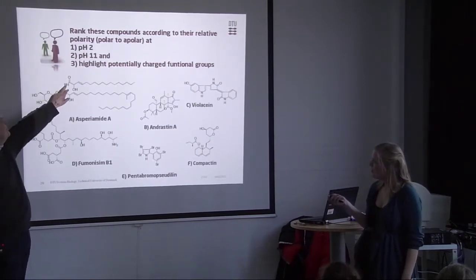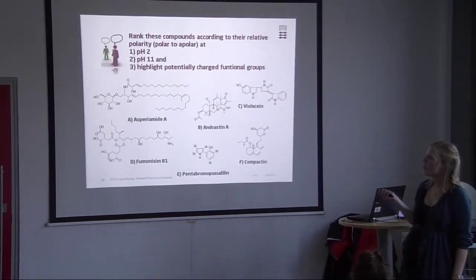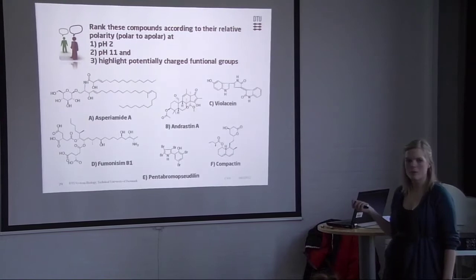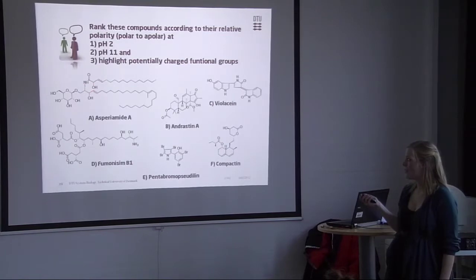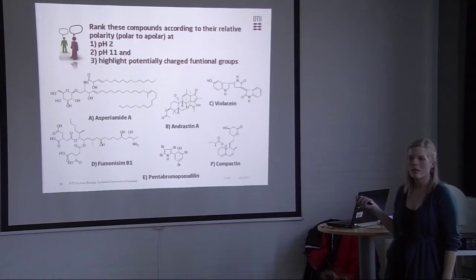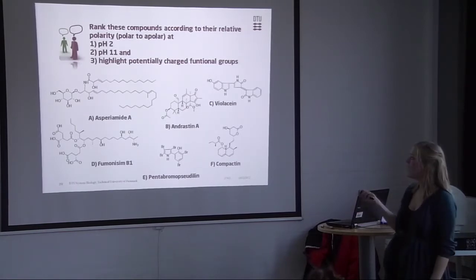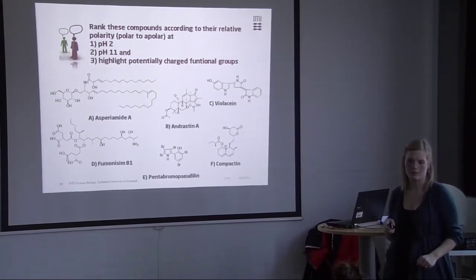And yeah? This is an amide, so no charge. Yeah, exactly. So this compound won't be affected by a charge either at low or high pH, because amides are not particularly good at accepting extra protons. And also this hydroxyl group is sitting in beta position to the double bond, so that will also hold on quite tightly to its proton. So it won't be affected at all. So this will actually represent the apolar end of the scale, both at high and low pH.